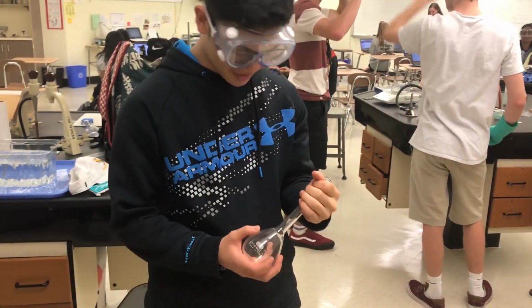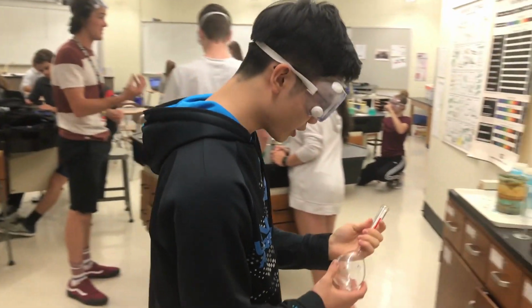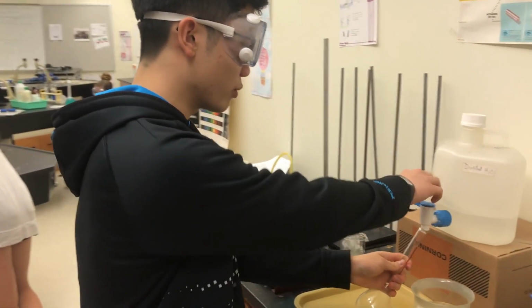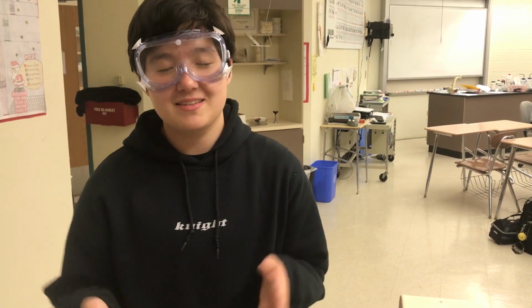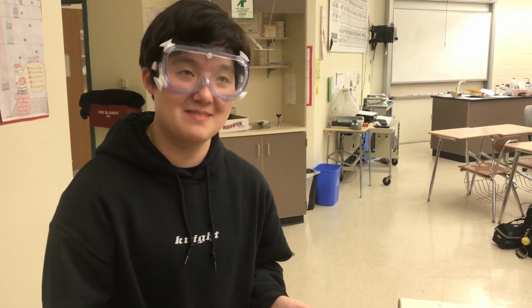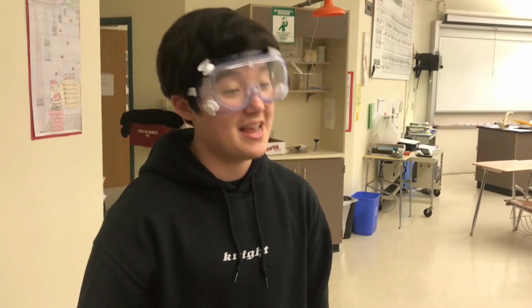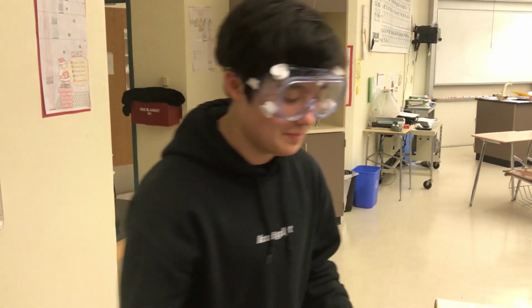So, first step in titration is we have to make the stock solution. We're going to get this 250 milliliter volumetric flask and fill it about halfway with water. The next step is to weigh out the appropriate amount of potassium permanganate needed to make it. Our calculations have us conclude that the appropriate amount would be 0.798 grams, so we are going to use the scale to get an accurate measurement.